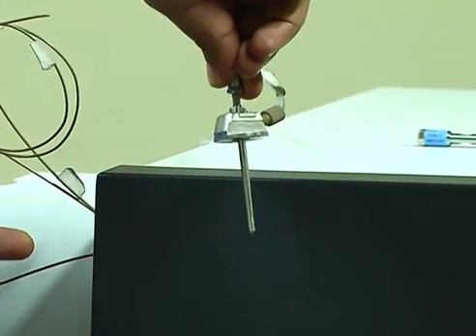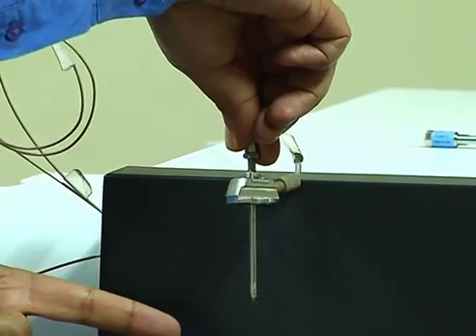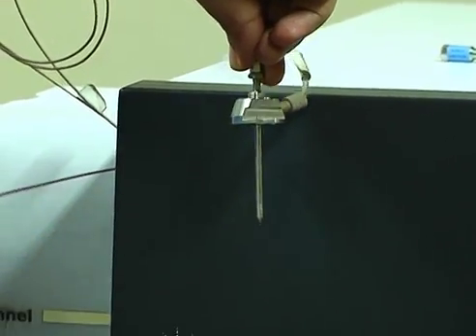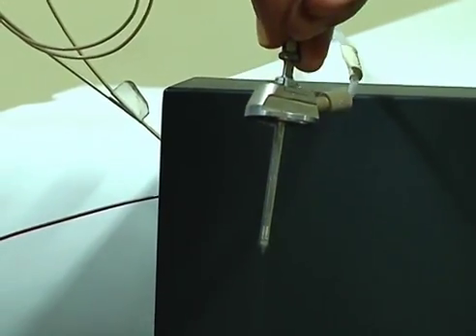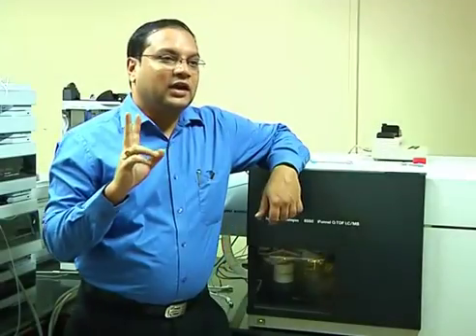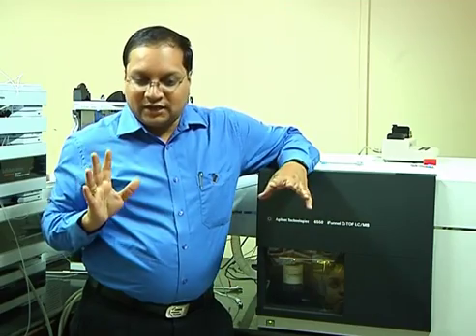You see, this is how it happens. Now one drop has become like this spray, and inside there is high temperature, 300. You can imagine how fast, unimaginable speed it has to. So there are different analyzers.